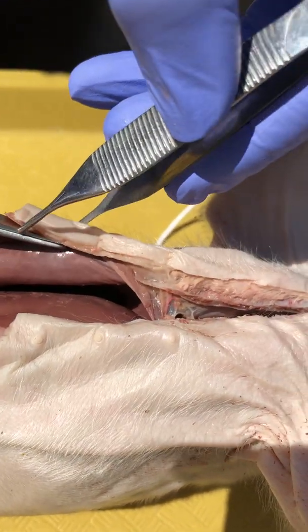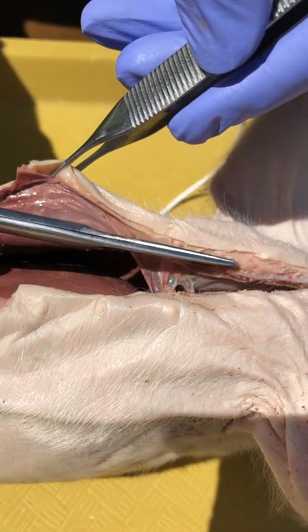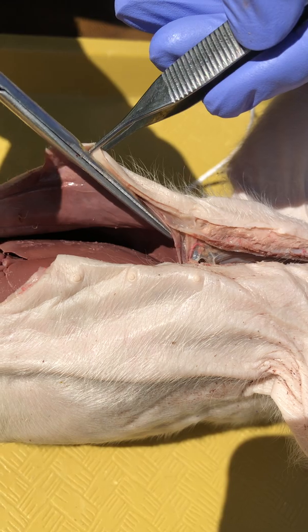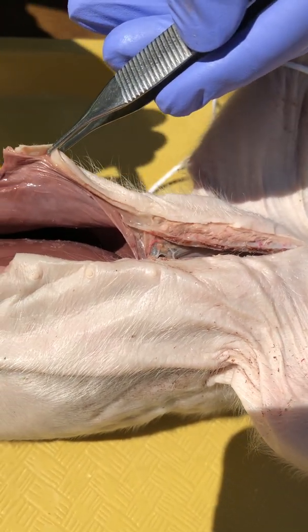This is going to be the thoracic or pleural cavity. What's this boundary? Well, it's made of muscle. I can pull the body wall back and you can see this muscle. The question is how am I going to open this up and not destroy that muscle? That muscle is the diaphragm — it's the anterior boundary of the abdominal cavity and the posterior boundary of the pleural or thoracic cavity.